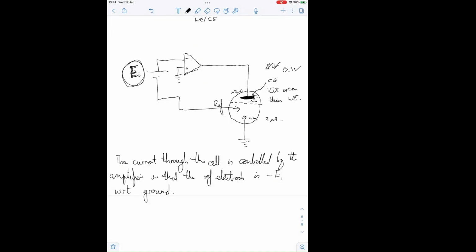Now, another thing that can happen at the counter electrode is something I have had students run into. They'll say, oh, my system says voltage overload, but it's still working, so I just carry on. What does a voltage overload mean? It's something lots of students get upset about with their potentiostat.